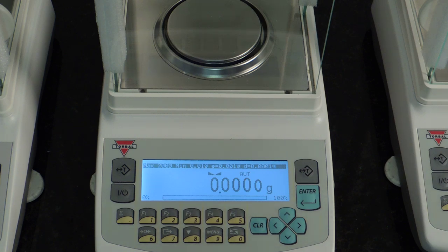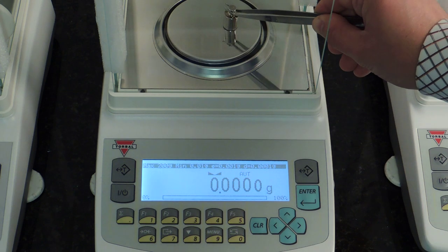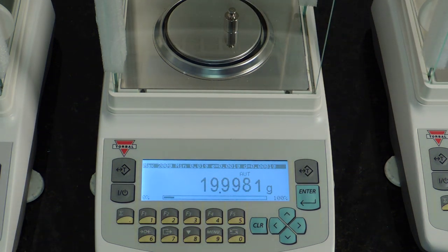In this video we will review the Torbell AGN analytical balance. The AGN is one of Torbell's most popular scales. It is also one of our best equipped models.